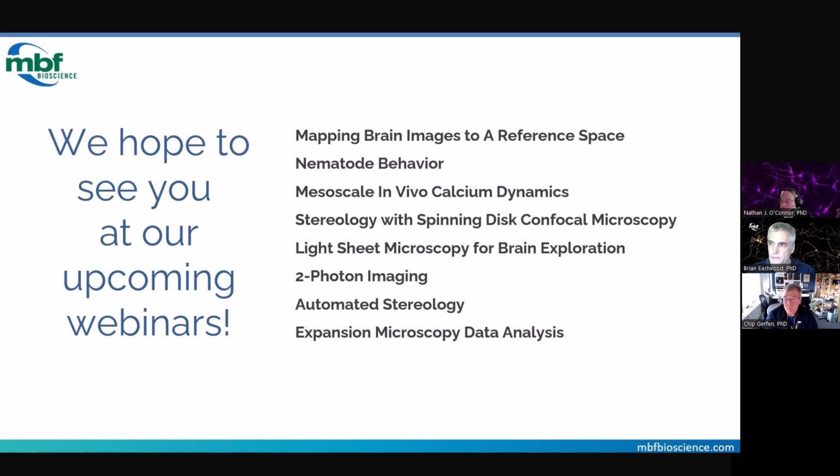So what I do is we use the Allen CCF because it covers most of the brain that we're most interested in. But there are other atlases that have been incorporated into this, and I'll let Brian speak to that. Yeah, so for mouse, we have 2 different atlases. We use the Allen CCF, and we also have the one that we developed together that has a Nissl average brain. And then for rat, we have the Waxholm space, which is one of the standard atlases for rat.